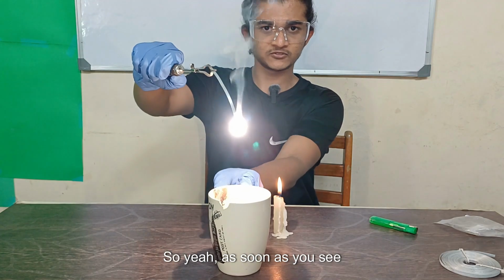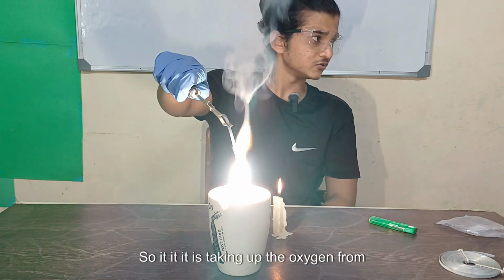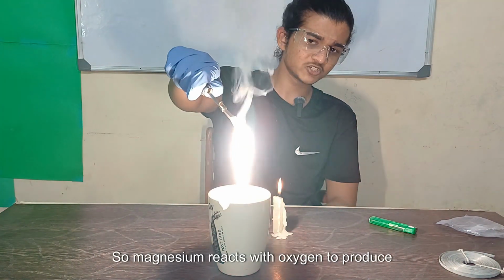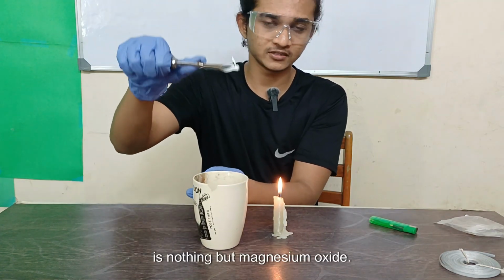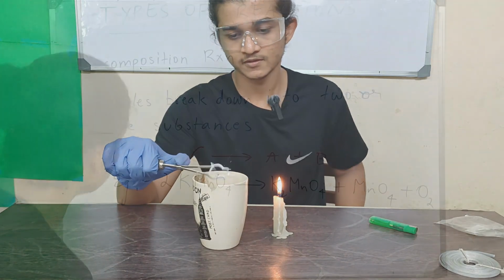As soon as you see, it starts burning very brightly. It is taking up the oxygen from the air, and it's producing magnesium oxide. So magnesium reacts with oxygen to produce magnesium oxide. It's very bright. The ash which was left over is nothing but magnesium oxide. So this was the example of combination reaction.